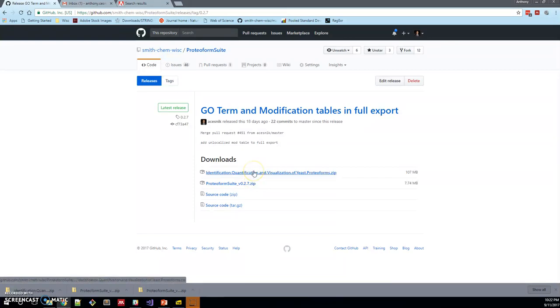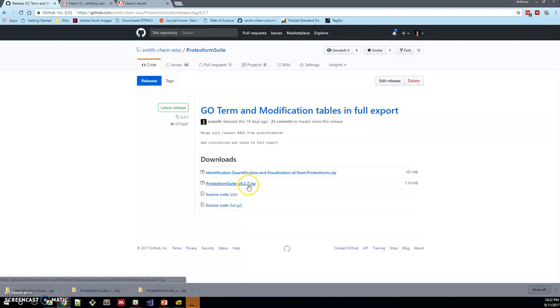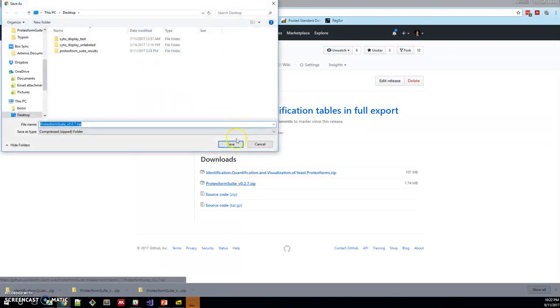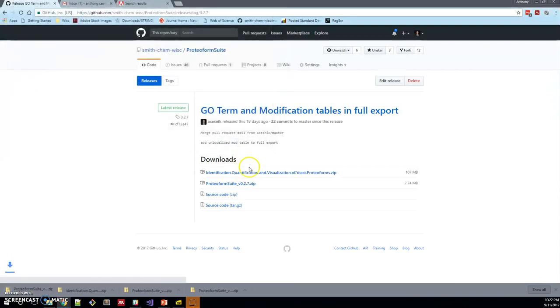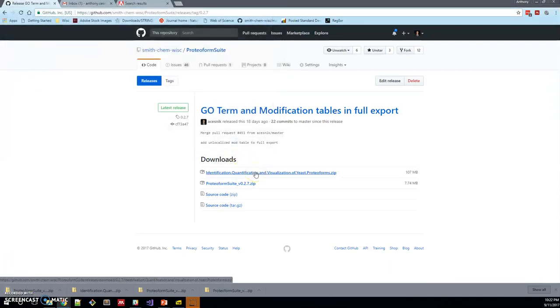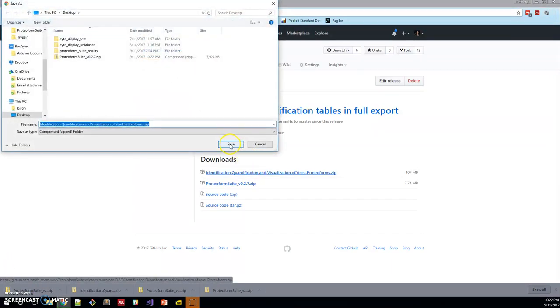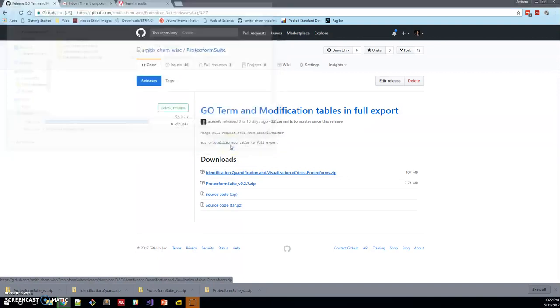And this is the vignette. So this contains all of the input files and presets necessary to run this analysis.